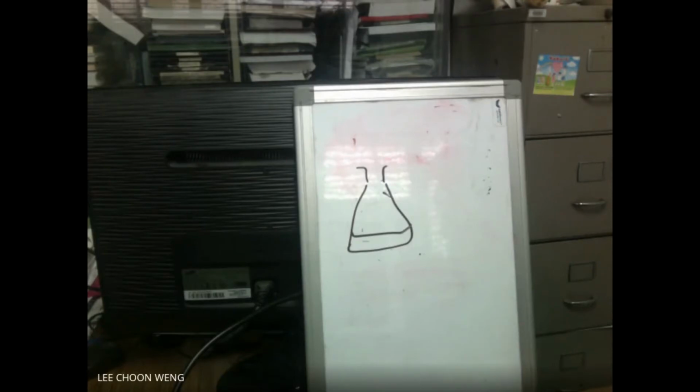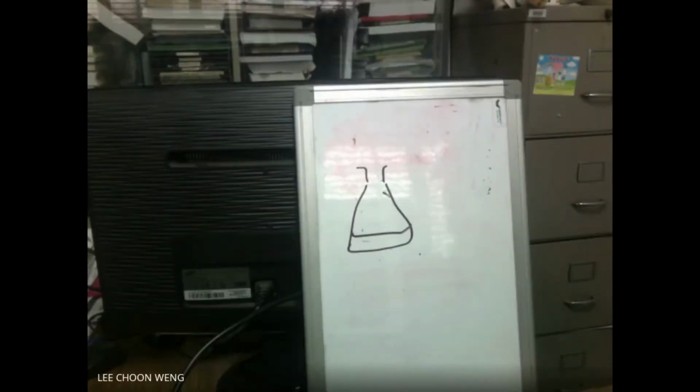Why don't we add more, 2 grams, maybe 10 grams? Because if the soil is too much, there's probability of air bubbles inside. Good try, but that's not the answer. Anyone else? It's always good to hear students trying. No harm. You all should learn to interact more. But anyway, anyone?